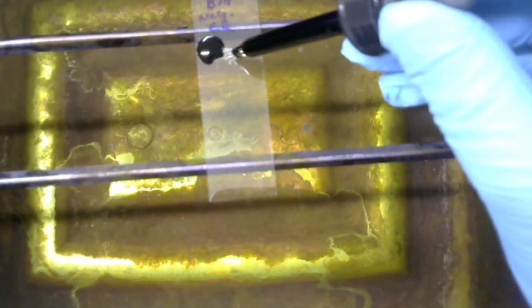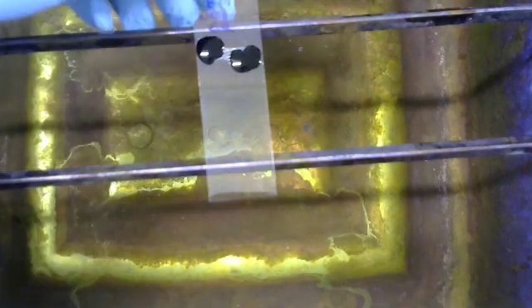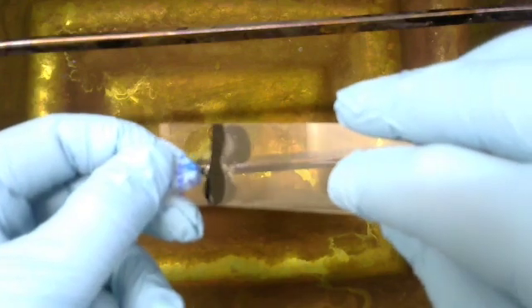Now we're going to need our stain. We're also going to need another slide. And we'll start with the bacillus. And we're going to add 2 drops. Now, what we're going to do, we're going to take our, and I used the wrong one for this, but that's fine, and we're going to slide right like that.